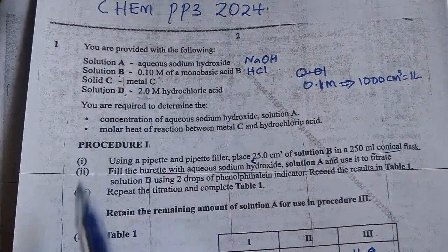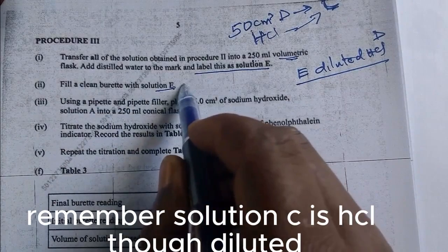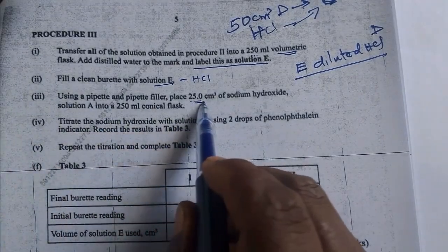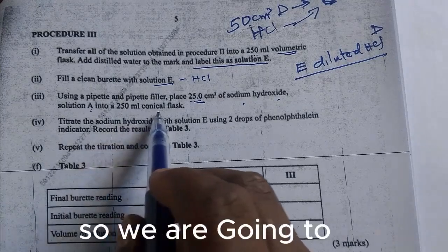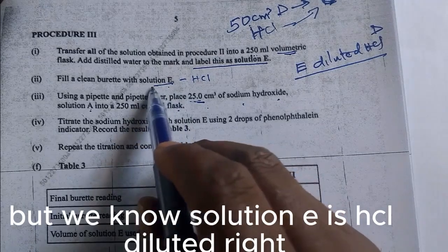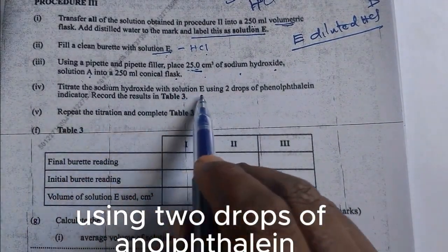Fill a clean burette with solution E. Remember solution E is HCl, though diluted. Using a pipette and a pipette filler, place 25 centimeters cube of sodium hydroxide, solution A, into a conical flask. So we are going to titrate solution E against solution A, which is sodium hydroxide. But we know solution E is HCl diluted. Titrate the sodium hydroxide with solution E using 2 drops of phenolphthalein indicator.